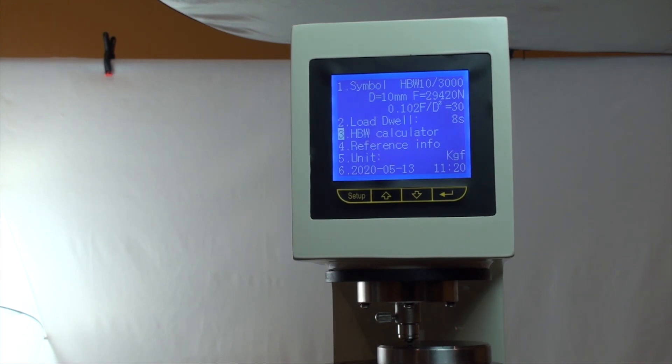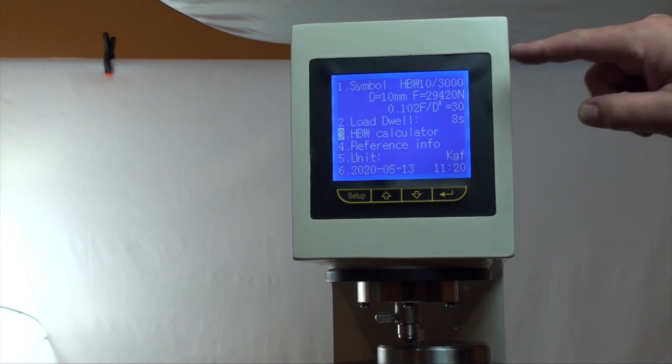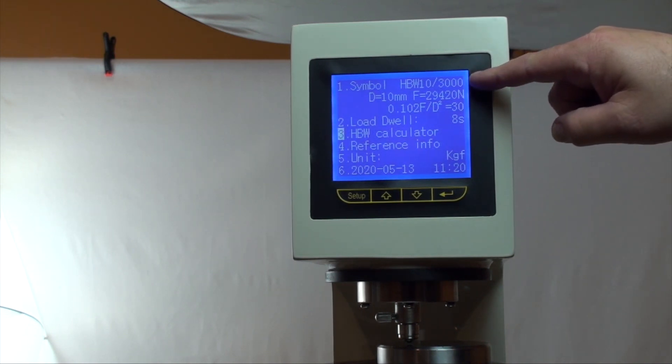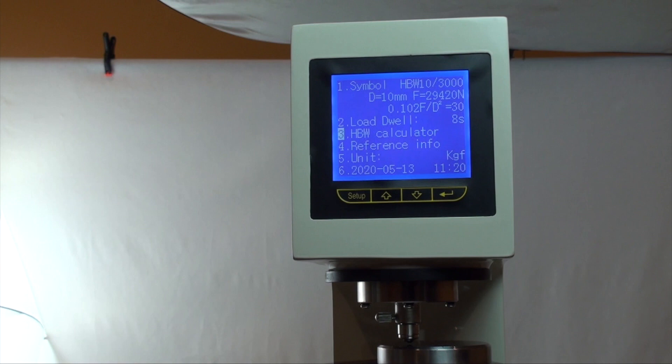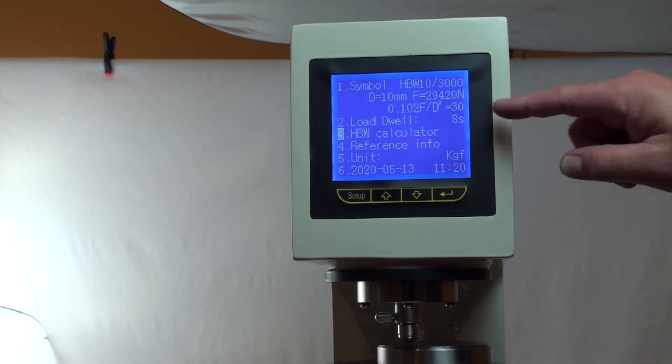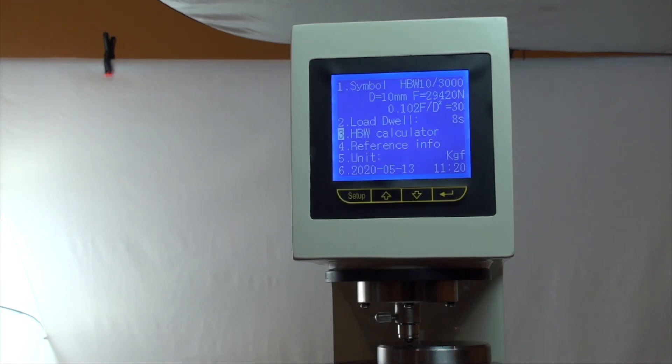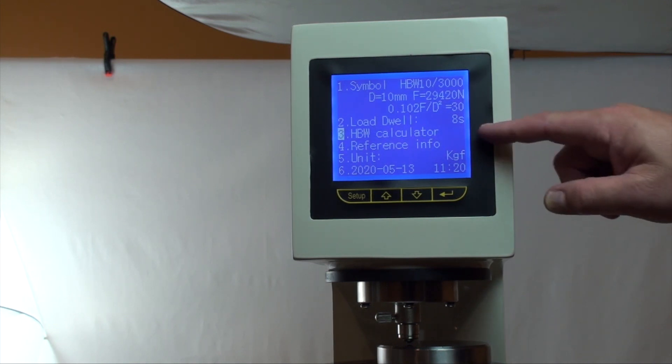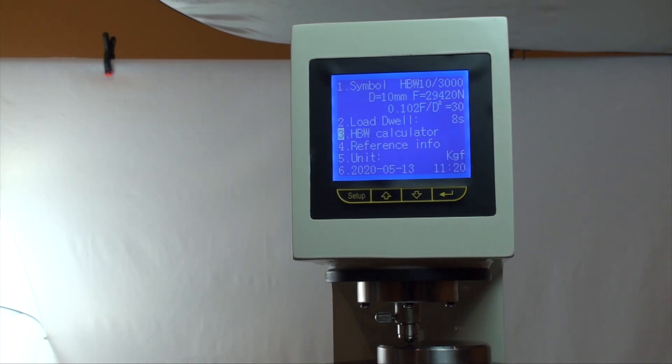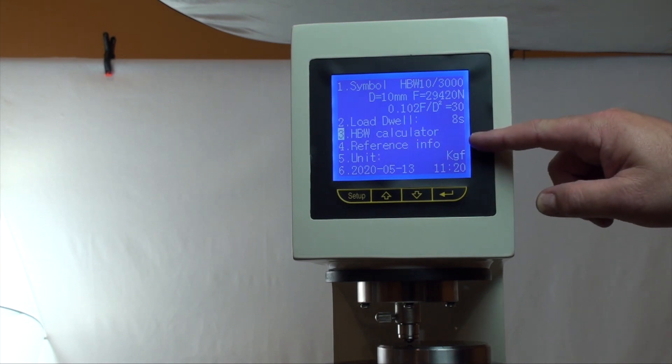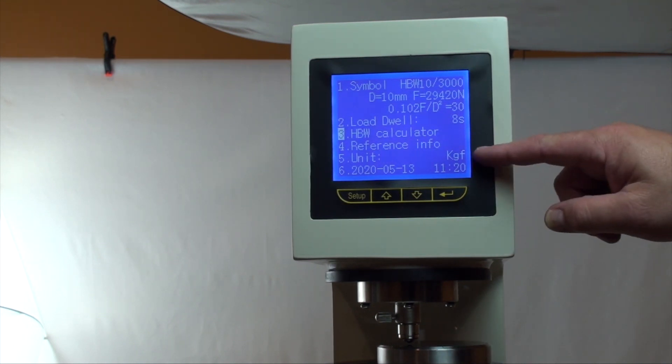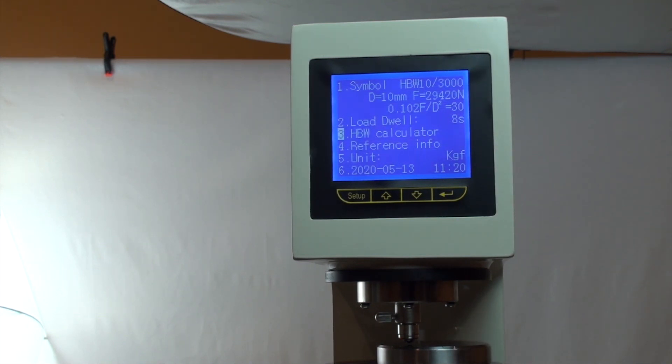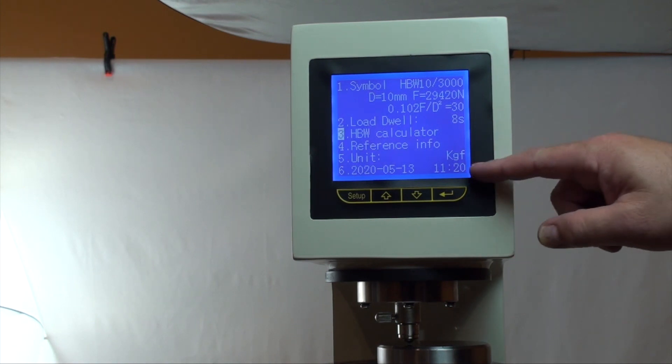You'll first find Brunel scale parameters. There are 12 to choose from. A 3,000 kg load with a 10 mm ball is the most common. Also included are load dwell time, Brunel calculator, reference info, measuring unit, and the date and time stamp.